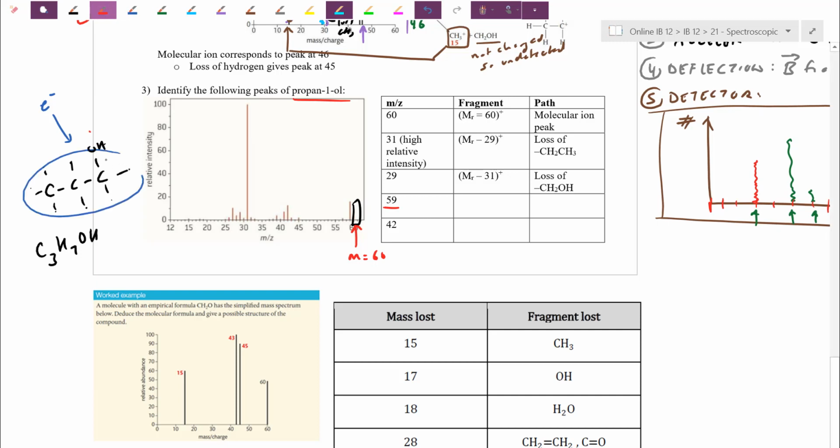If this electron bombardment dislodges a hydrogen, and the remaining grouping here is positive, this part here would be my CH3, CH2, CH2O, maybe I have that group left, and that's having lost an H. So I was a 60, if I lost one, I'm hitting at 59, the remaining part of it is 59. It could have been that hydrogen, could have been another hydrogen, but that part there has to be positive. Okay?